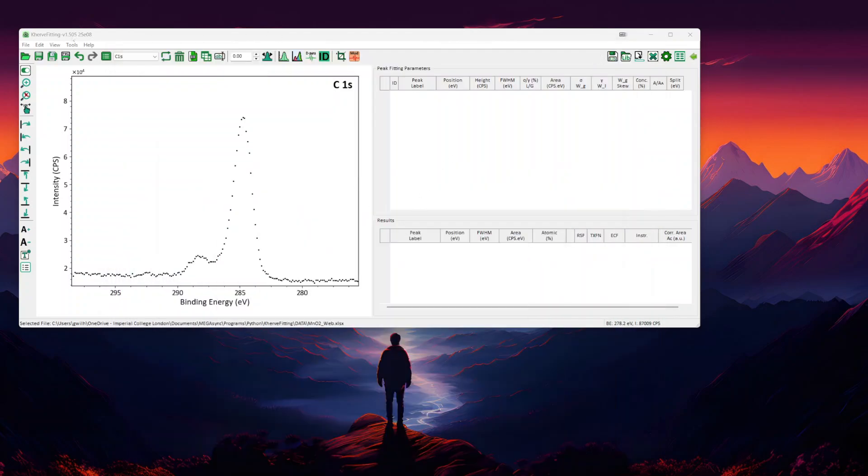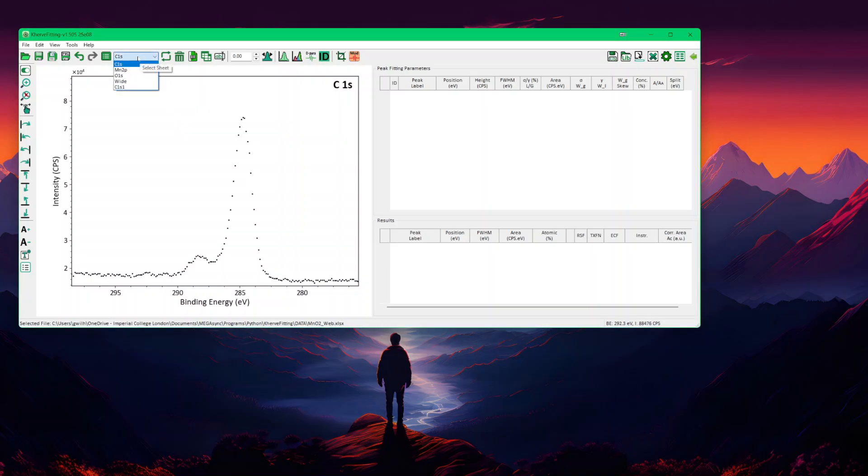This is the software, curve-fitting version V1.505. In here, it's the MNO2 samples. The combo box here shows you the carbon 1S, MN2P, oxygen 1S on the wide.